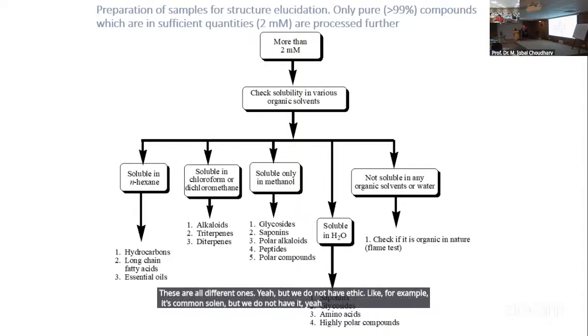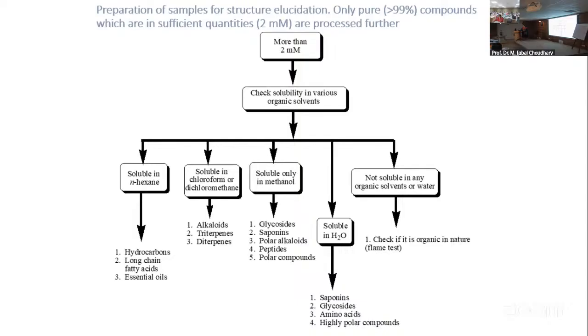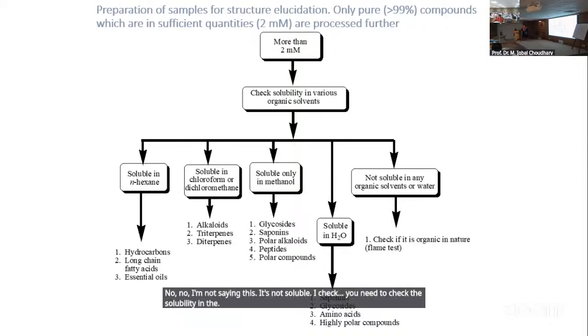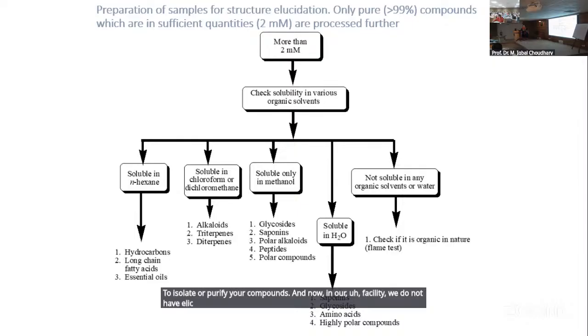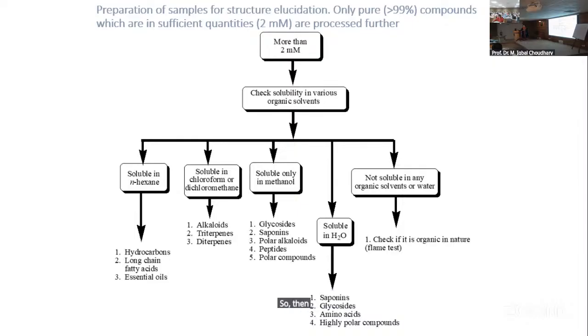As you said, it's not soluble. No, I'm not saying this is not soluble. I said you need to check the solubility. For example, if you have used ethyl acetate to isolate or purify your compounds, now in our facility we do not have deuterated ethyl acetate. So then you need to check whether your compound is soluble in chloroform, in methanol, in a mixture of chloroform and methanol, or in DMSO, or in pyridine. These are the solvents that are available.